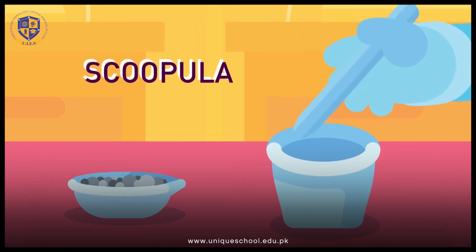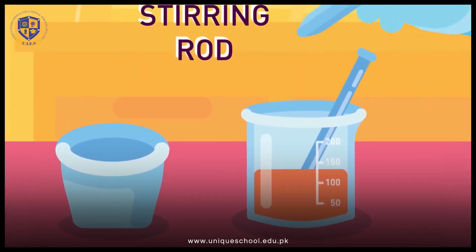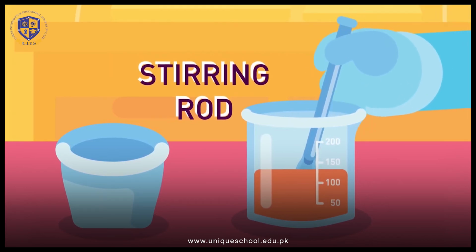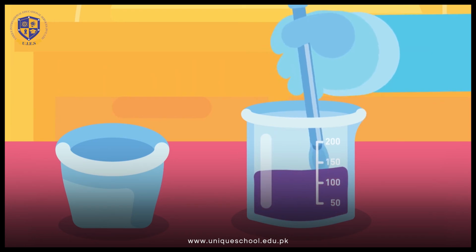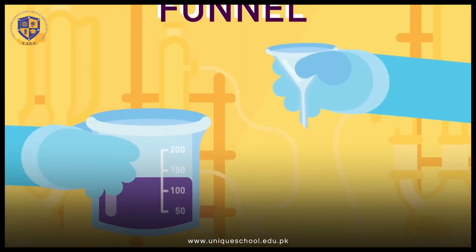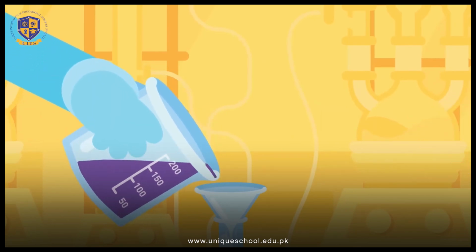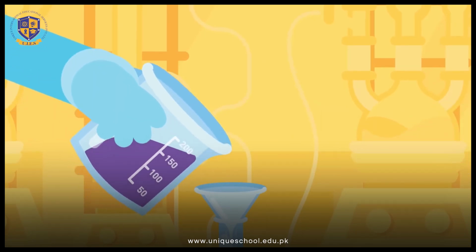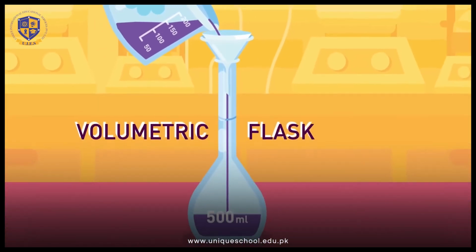Scoopula. Used to transfer solids. Looks similar to a spoon. Stirring rod. Used for stirring and mixing and is usually made of glass. Funnel. It is used to transfer liquids or fine-grained materials into containers with small openings. Also used for filtration.